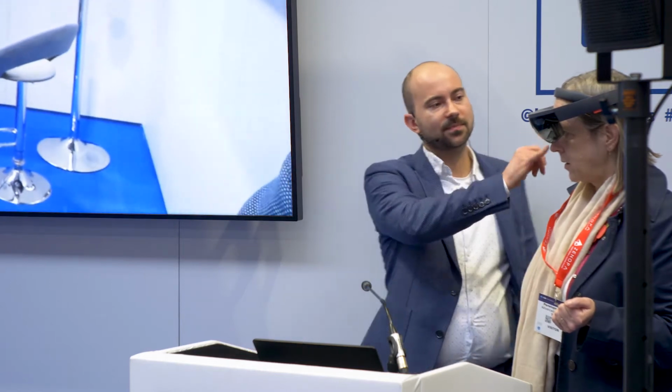And the gentleman who asked about how it would impact moving around in a laboratory: is this dimming that I get permanent? With the first one, yes. Second version, I'm not sure how much it is dimmed, but it is dimmed. Right, okay. Because you have 4 layers of glass here, and in every layer of the glass, you can have a separate color. And to put the screen onto those holographic displays, you need a slightly dimmed screen.